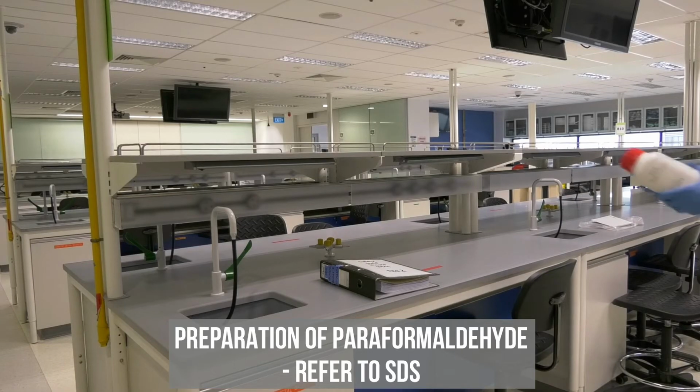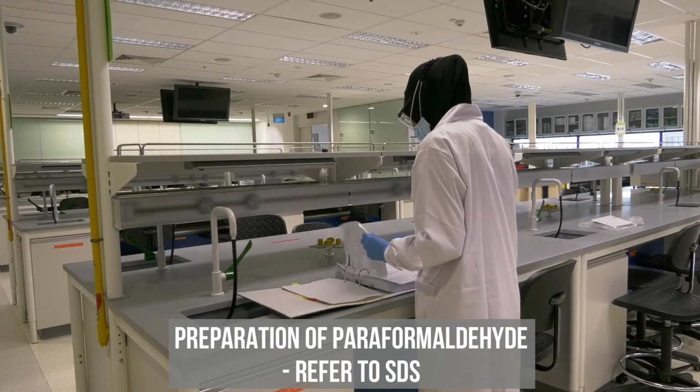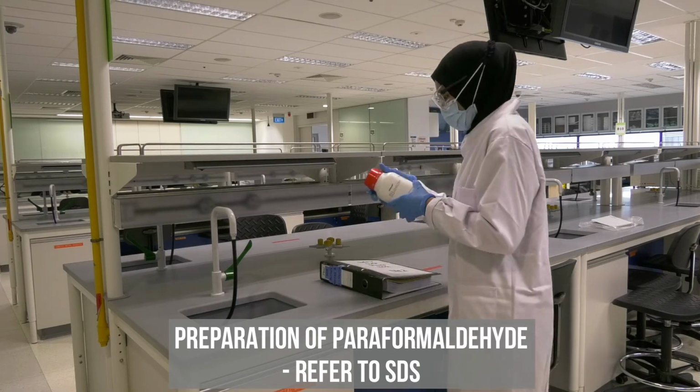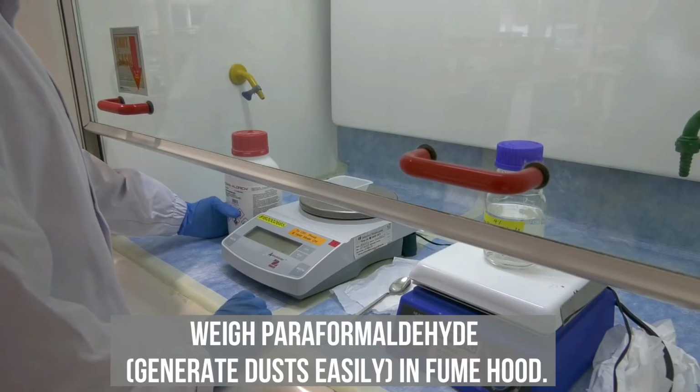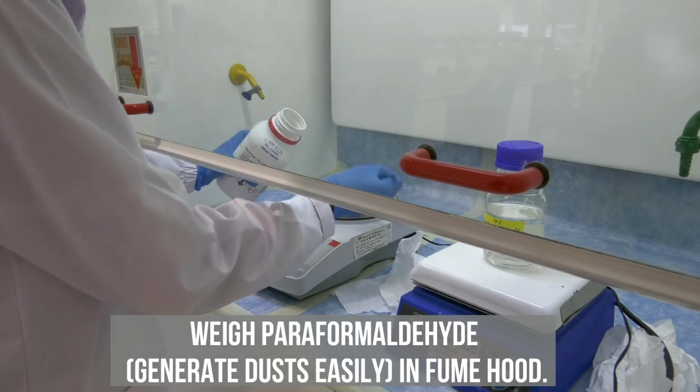In this scene, Foding is preparing 4% paraformaldehyde. She refers to the SDS and realizes that it has to be prepared in the fume hood as it generates dusts easily. She opened the chemical bottle gently and weighed out the required amount of paraformaldehyde in the fume hood.